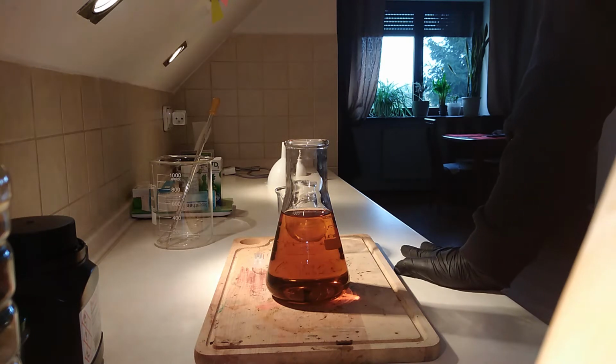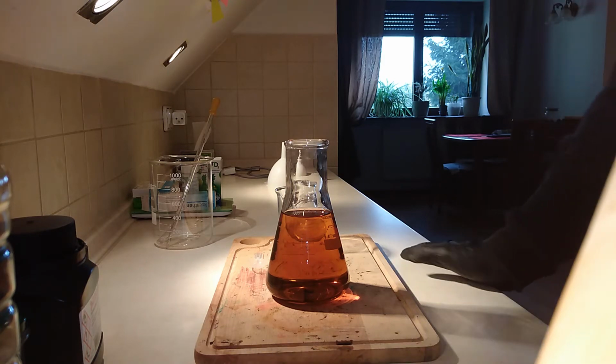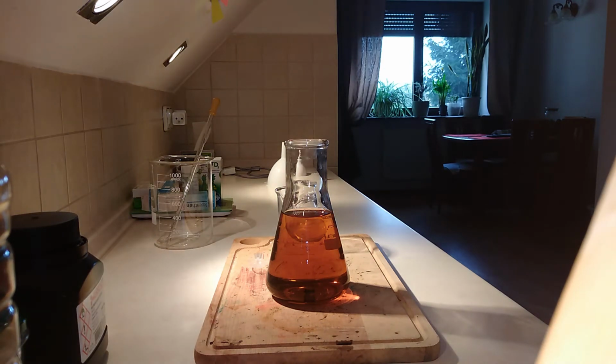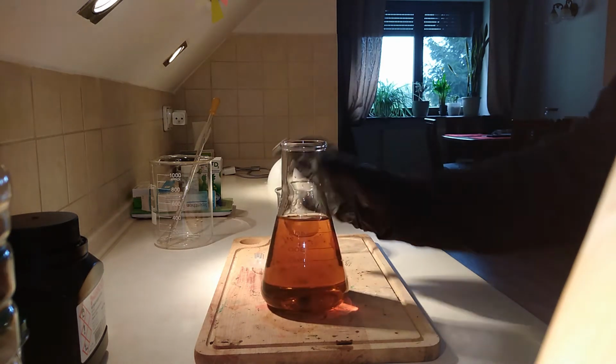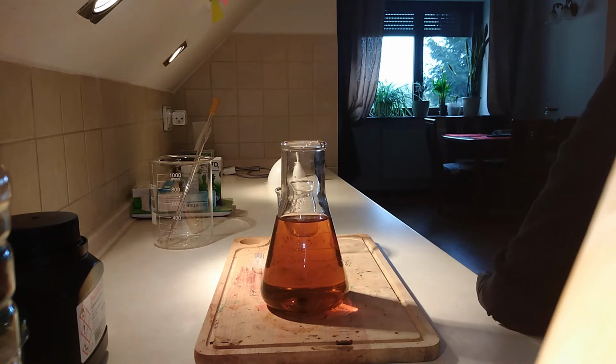Which means the manganese is in a lower oxidation state. Here, it's 7, a really high oxidation state. But then it goes to 5. I think it's 5. Yes, it's an oxidation state of 5. And now, when it's brown, the brown color is from manganese dioxide, which forms, and it's in an oxidation state of +4.